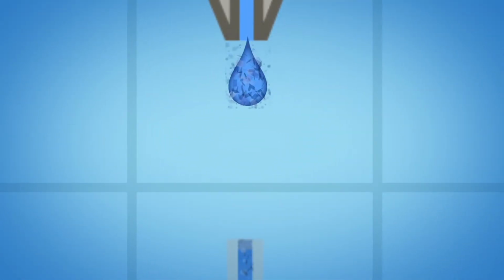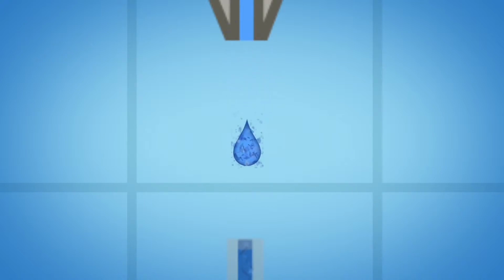Inkjet droplet ejection is particularly well suited for concentration. Concentration is done by ejecting small droplets from the ejector that is aimed at a collection tube oriented some distance from the ejector. As such, the droplets fly through the atmosphere as they move from the ejector to the collector.